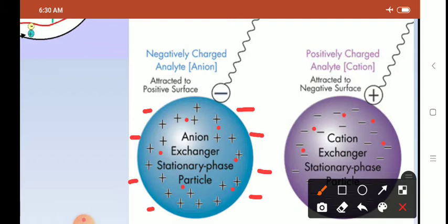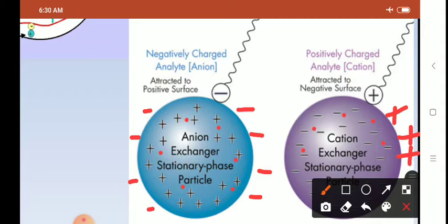In a cation exchange resin, functional groups are stationary, they are attached, they are negatively charged ions, and the counter ions, which are positively charged ions, are then attached on the surface. They are electrostatically attached on the surface of the cation exchanger, and can be exchanged.